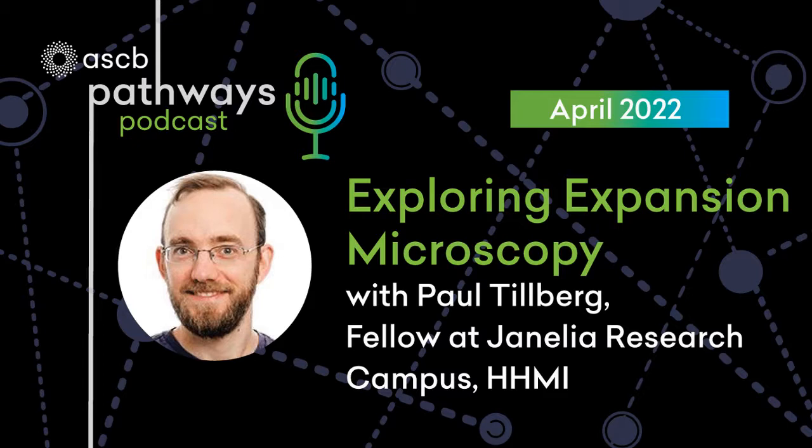Well, one thing, of course, is to further that democratization. I think there's a lot more potential there than has been realized. And one thing is that it appears to be a fancy technique, with things that people, especially microscopists, may not be familiar with, these kinds of specimen processing steps. But they're not actually that bad. You can pick it up pretty easily. So I think that people might be a little hesitant to try it out because they're not sure it's going to work. Maybe it's not going to work. Maybe I'm not going to know if it's working. So there's more work to be done there to get the word out, get people to try it.